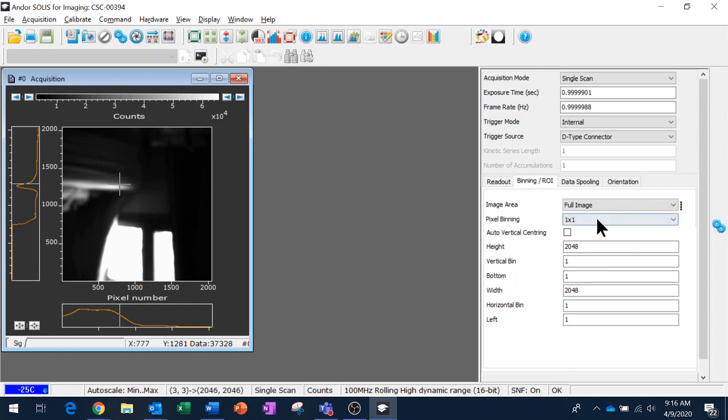However, you might notice that unlike a CCD camera, when I turn on pixel binning, even at a large extent, and I try to go to the maximum frame rate, my maximum frame rate is unchanged. This is because of the sCMOS active pixel technology. I'm doing the addition not on the chip and not saving additional ADC read cycles, but I'm doing it on the head, which is to say in the camera's memory and processor, which, although it speeds up information transfer along the USB connection, it doesn't actually change the number of pixel reads that I'm doing, so it doesn't speed up the frame rate.